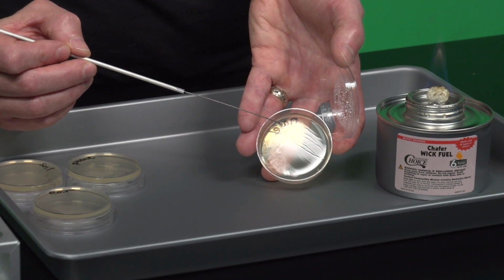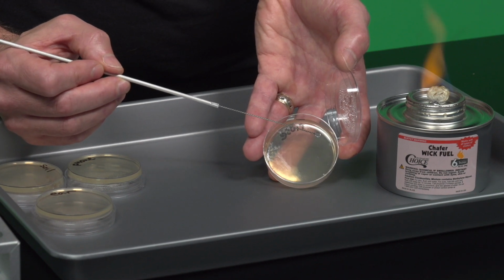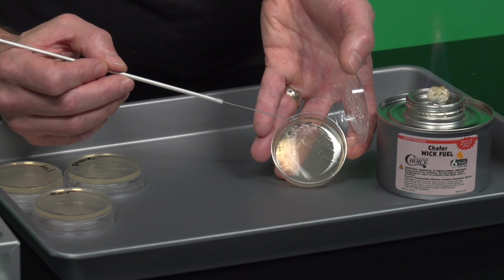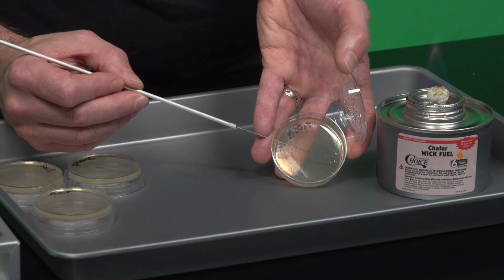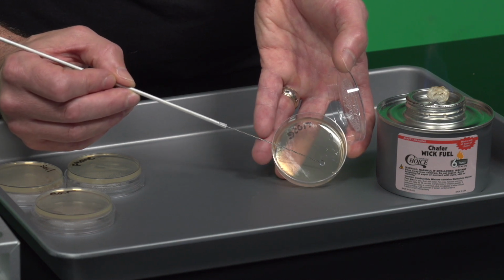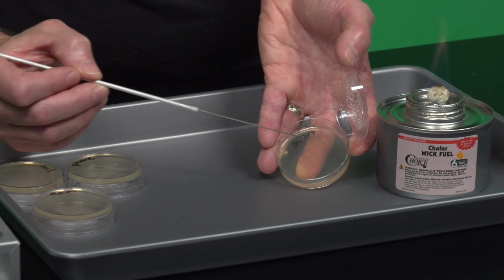There's the streaks. Bear with me while I try to get it in the camera. So basically what we have here is going from this quadrant into the next one, back in, and then out, and then back, and I'm not going in now.